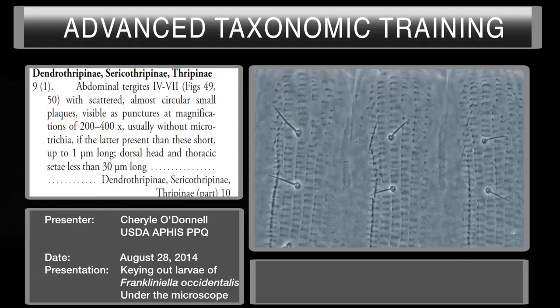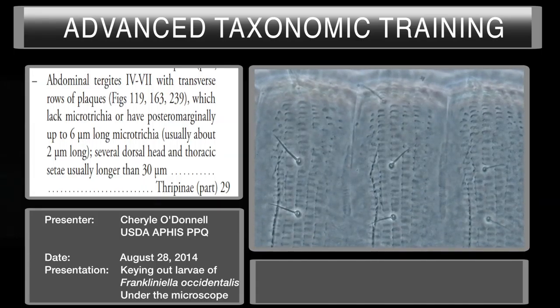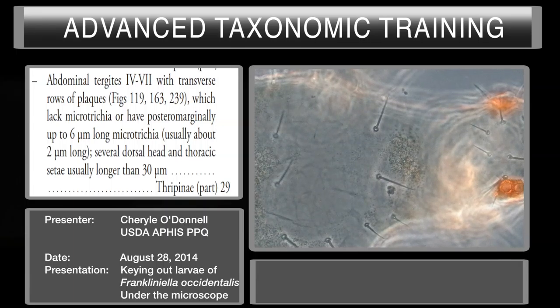Moving to the second part of couplet 9: transverse rows of plaques — transverse would be this way — and yes, we have many rows of these elongated oval-shaped plaques. They lack microtrichia, so there are no long teeth on here. And there are several dorsal head and thoracic setae usually longer than 30 microns. Looking at the dorsal setae on the head and thorax, they are quite long — about 30 microns long. This takes us to the Thripinae subfamily, and that is couplet number 29.